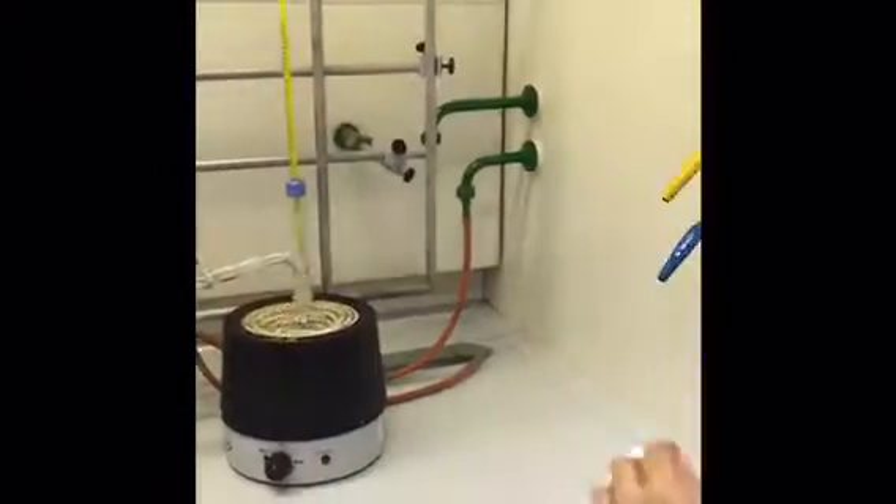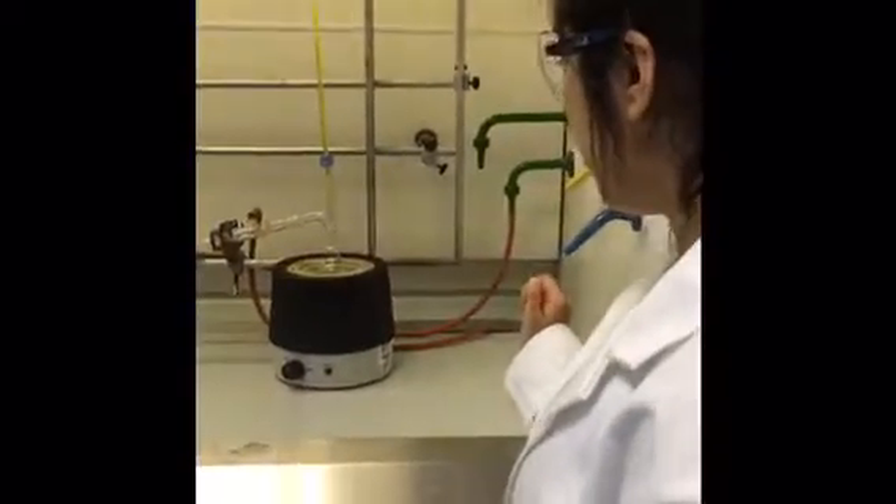So once it's reached the boiling point of the first liquid to be separated from the mixture, it will start coming out of here. When the temperature rises again to the boiling point of the second liquid to be removed from the mixture, I'm going to quickly remove the beaker and replace it with a new one to collect the second liquid, and repeat this process until I've removed all the liquid.